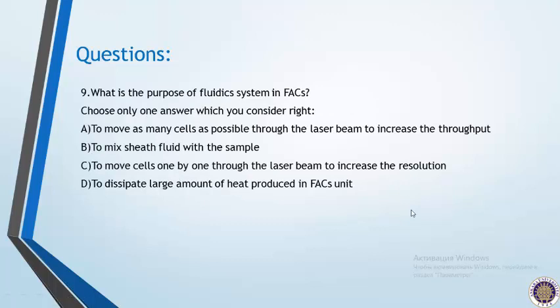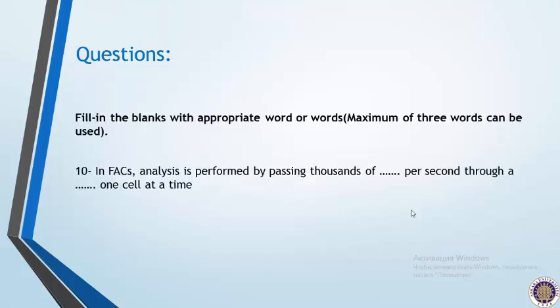What is the purpose of the fluidic system in FACS? Choose only one answer which you consider to be right. Tenth question. Fill in the blanks with appropriate word or words. A maximum of 3 words can be used.